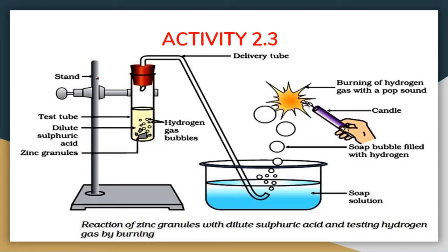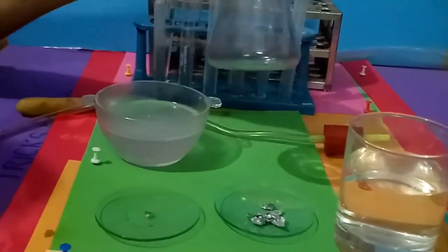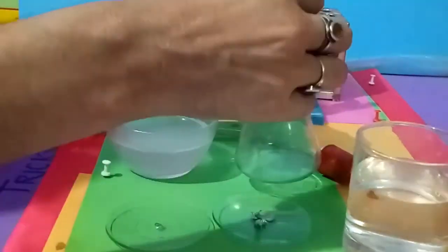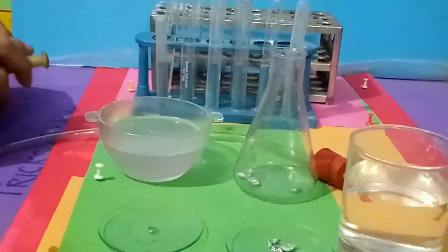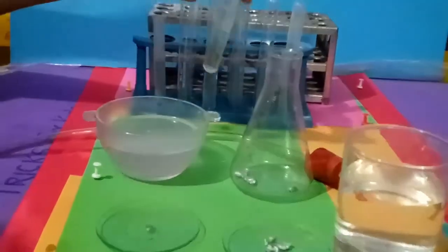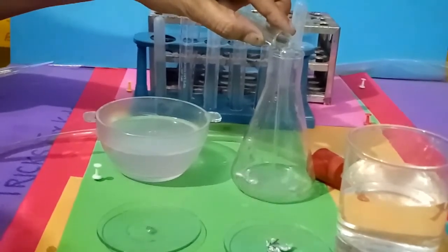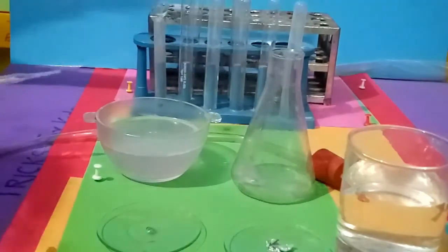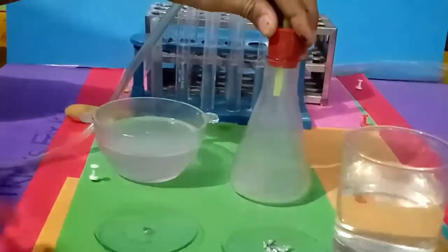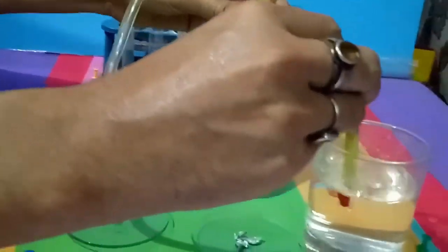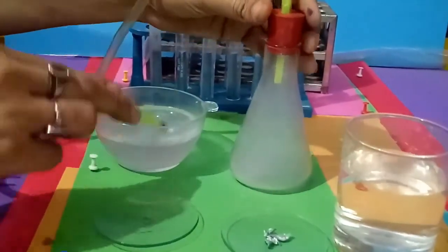In this activity 2.3, first we will take a conical flask and add zinc granules to it. Afterwards, we are going to add 5 ml of dilute sulfuric acid to it. Now here you can see the bubbles — gas bubbles are arising in the conical flask. We seal the conical flask and first we see the bubbles in water and then in a soap solution.